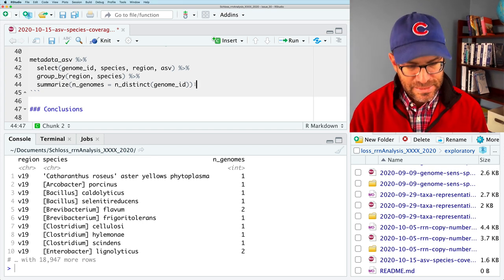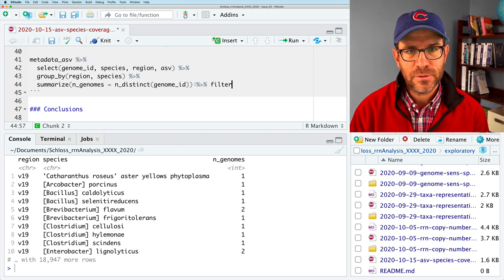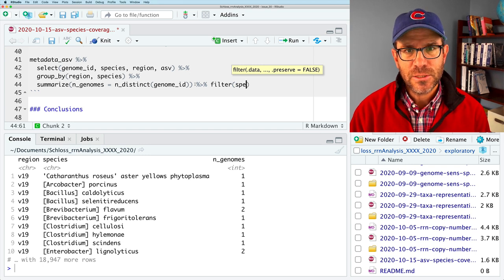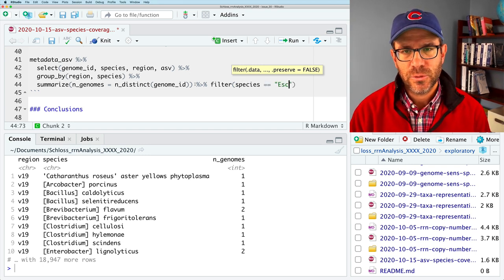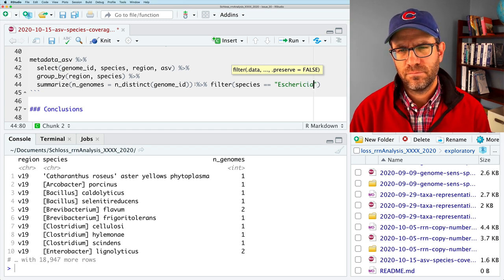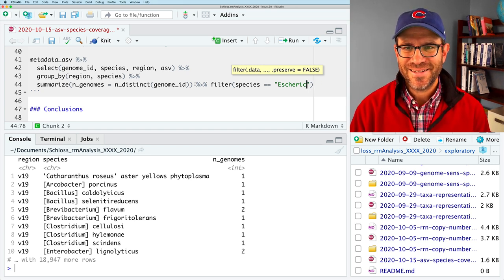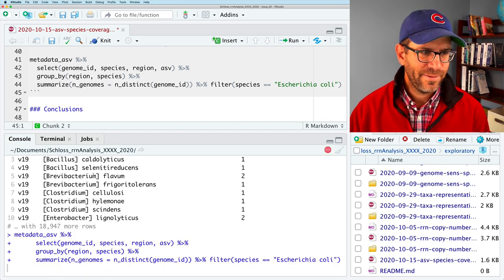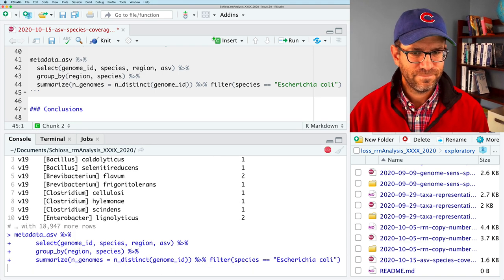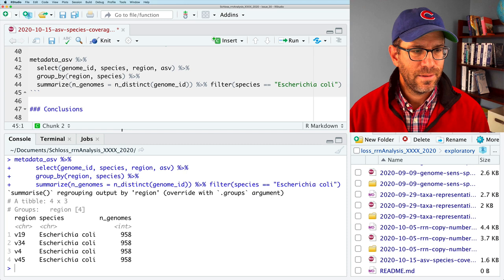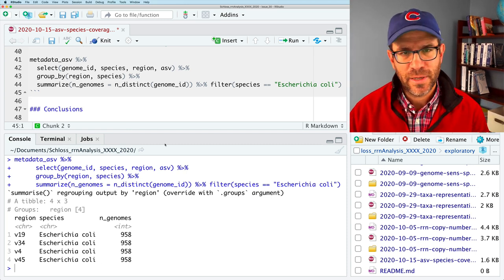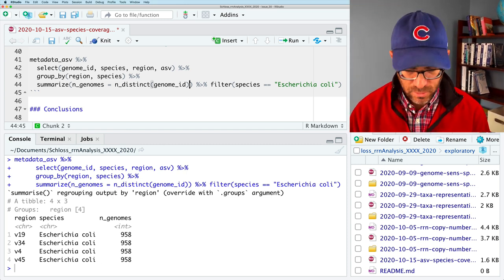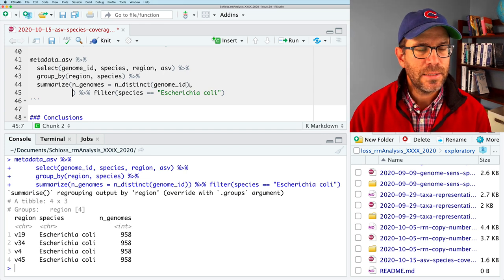So what we want to do next is we need to get the number of genomes for each species and the ratio of ASVs per genome. So I'm going to do a group by. So we'll group by the region and the species. Because we're going to group within each species is what we want the information by. And then I'm going to pipe that to a summarize. And I'm going to get a couple of variables. So I want to know the number of genomes for that species. So I will say n genomes and that's going to be n distinct. And then that's going to be on the genome ID column.